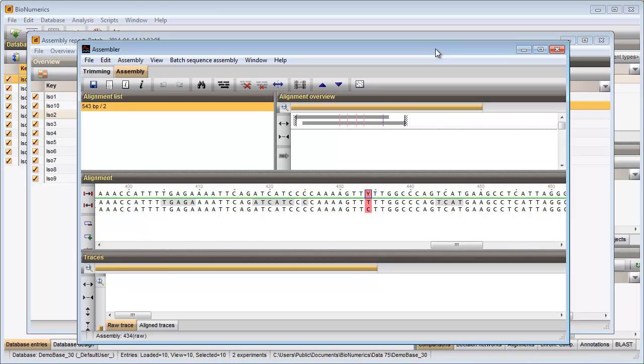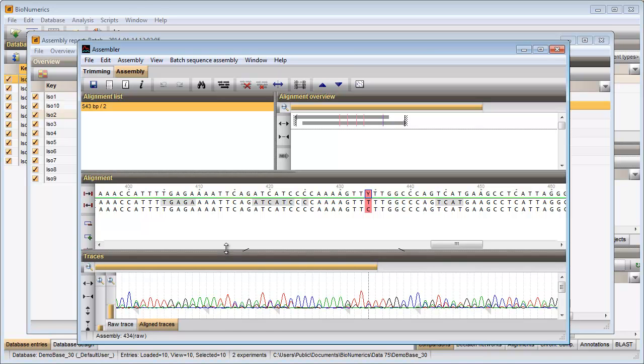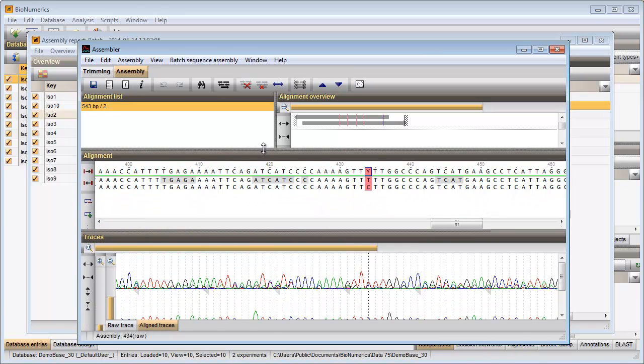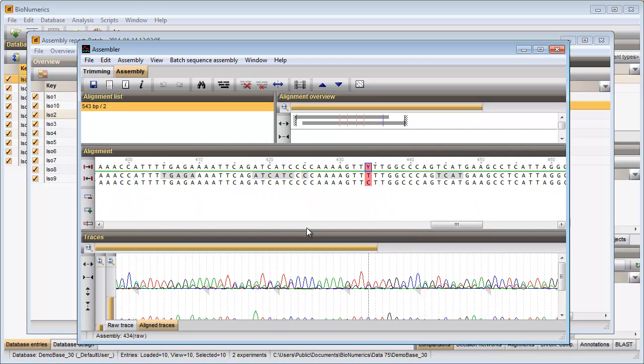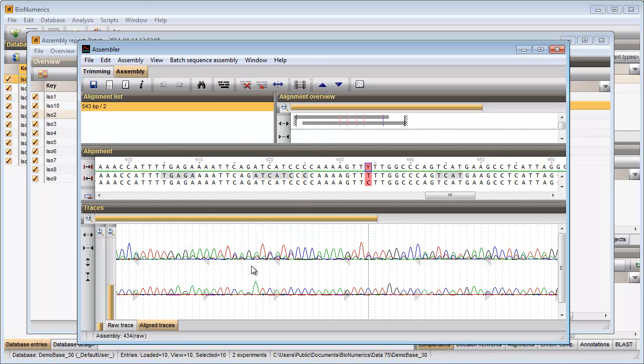These unresolved bases in the consensus are displayed in pink. I can look at the curves to check the base calling. I will update the consensus according to the curves.